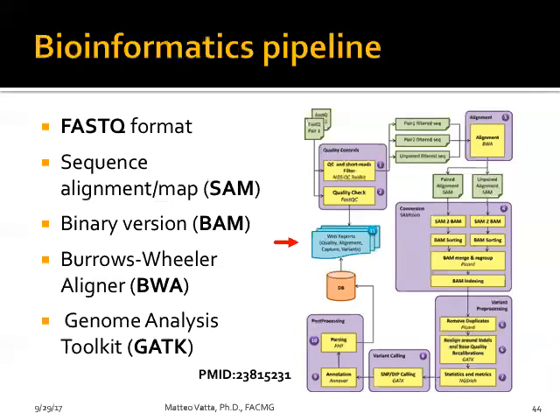But the most important thing to obtain is the data where all the sequences obtained from a clone will be then put together eventually in a contig and will be mapped against the reference sequence.